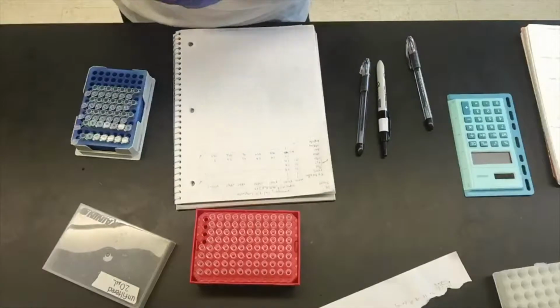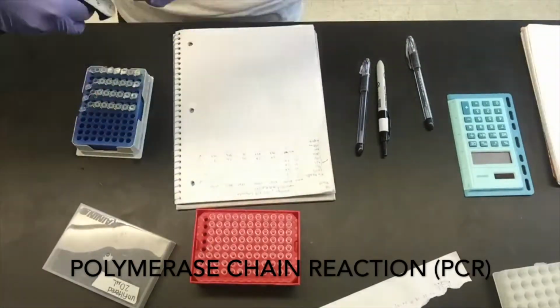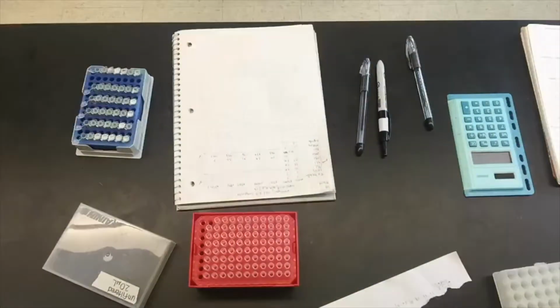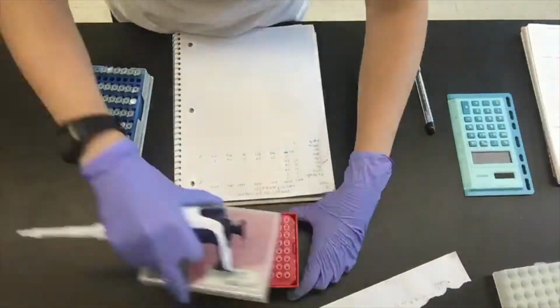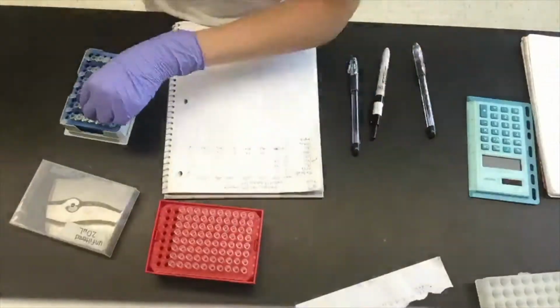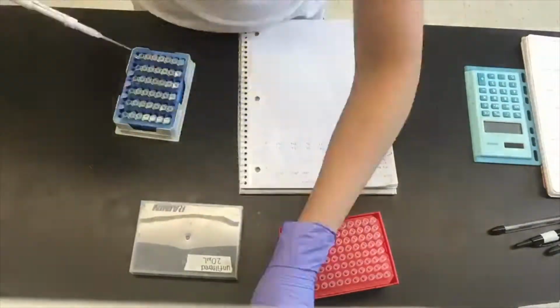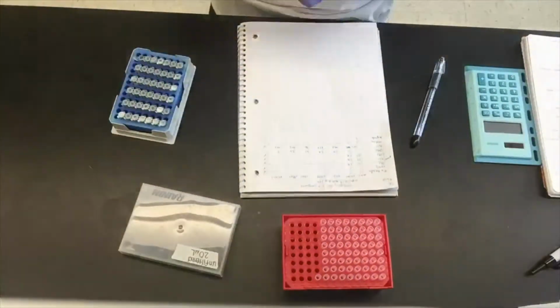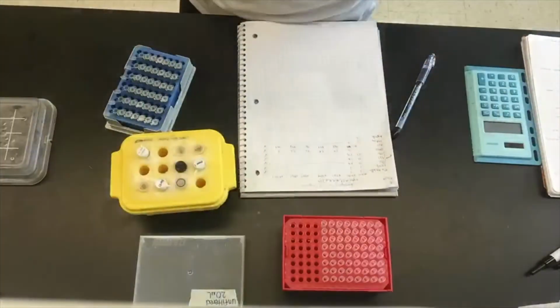Right now, Kirsten is setting up a polymerase chain reaction, or PCR. The Bartlett lab does a lot of PCR. It is a cheap and relatively simple method for amplifying the DNA sample to be studied. This is incredibly useful in many ways. For example, the DNA can be run out on a gel, which can reveal plant genotypes. The DNA can also be used in other experiments.